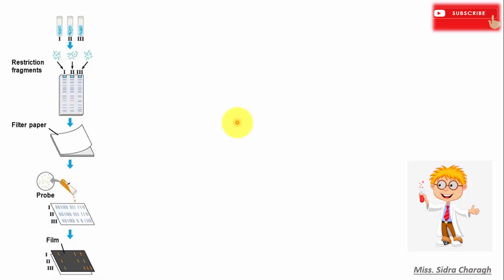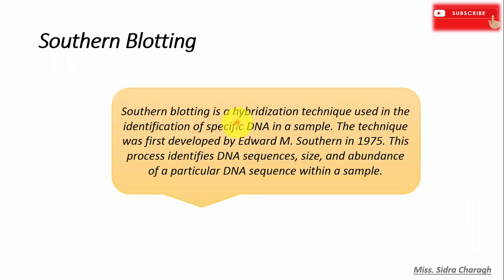In this lecture, we will discuss Southern blotting. Southern blot is an analytical technique used in molecular biology, immunogenetics, and other molecular methods to detect or identify specific DNA of interest in a mixture of DNA sample.